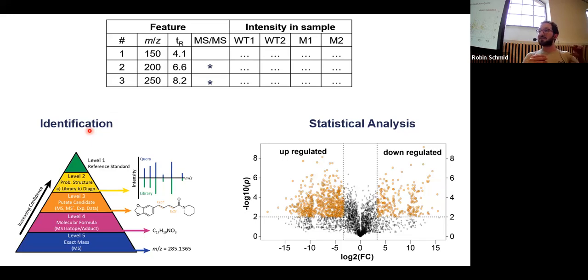Then later we can still do statistical analysis, and we can combine everything on molecular networking, like we're going to see later, and put significance and the annotations together. Because sometimes you might find a metabolite that is filtered out as being insignificant, but this insignificant compound was actually annotated. And then you might be losing some information if you just filter out all insignificant compounds.